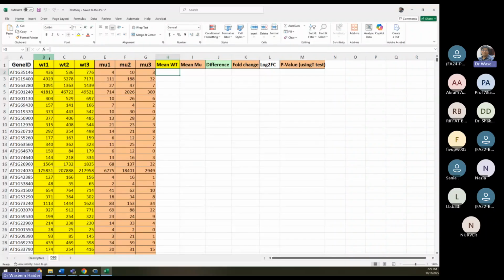So we took those six plants in two groups. One was assigned no treatment. The second group was given some treatment, some radiation or some chemicals or some reagents. Then we extracted their RNA, and sequenced them with the help of NGS technology. After this sequencing, we took those RNA fragments from the sequencers and mapped or aligned them on their reference genes or transcripts.